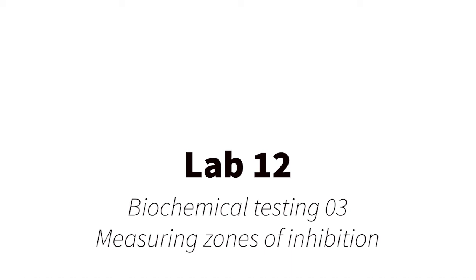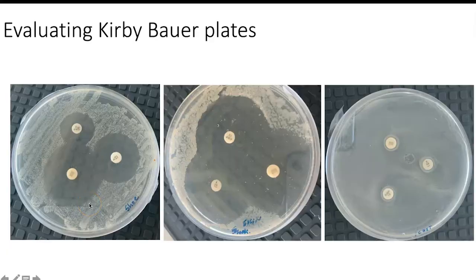So this is the last part of Lab 12 where we're going to evaluate the results of our Mueller-Hinton plates. So these are the results of my Mueller-Hinton plates. If you look, this is my shoe plate, and this creaminess that you see growing is the bacteria.